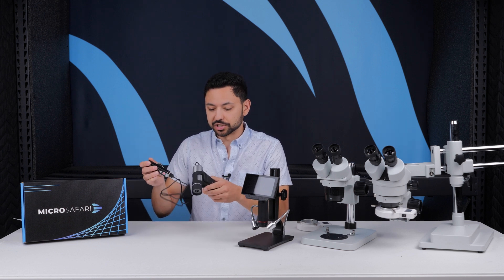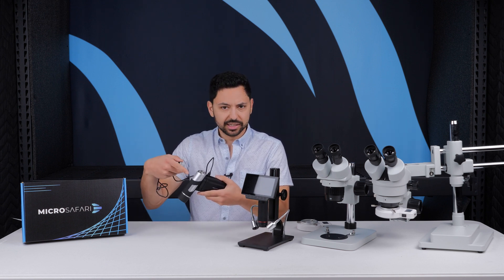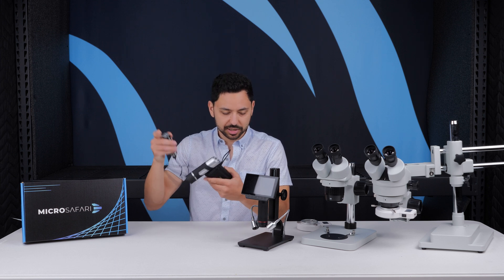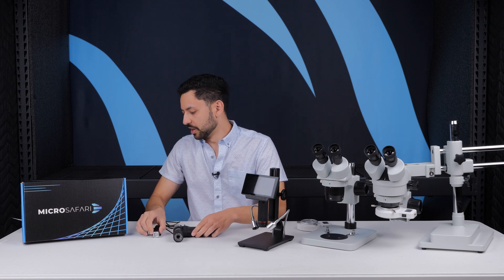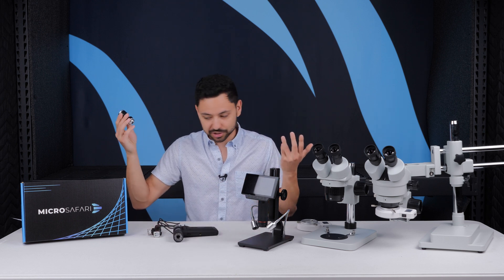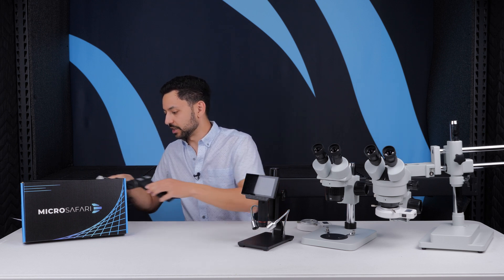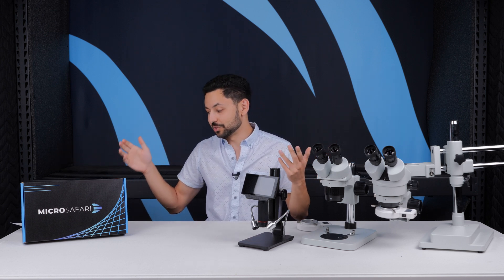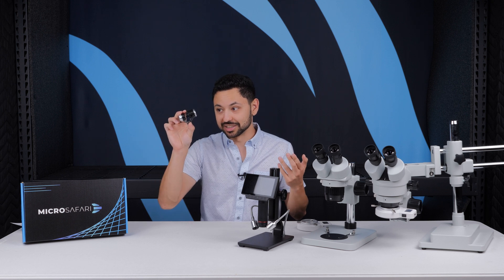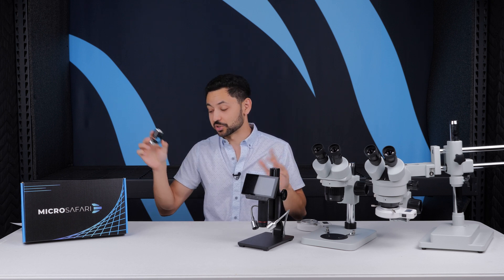These are getting a little pricier—this portable one is I believe $80, $90, $100, $120, somewhere in that range, and then this stand unit is around the $250 range. Something like a smartphone microscope is going to be about 20 bucks, so a big difference. But if they have an iPad or a phone to use, the amount of value that kids I've seen get out of just a smartphone microscope is pretty immense.